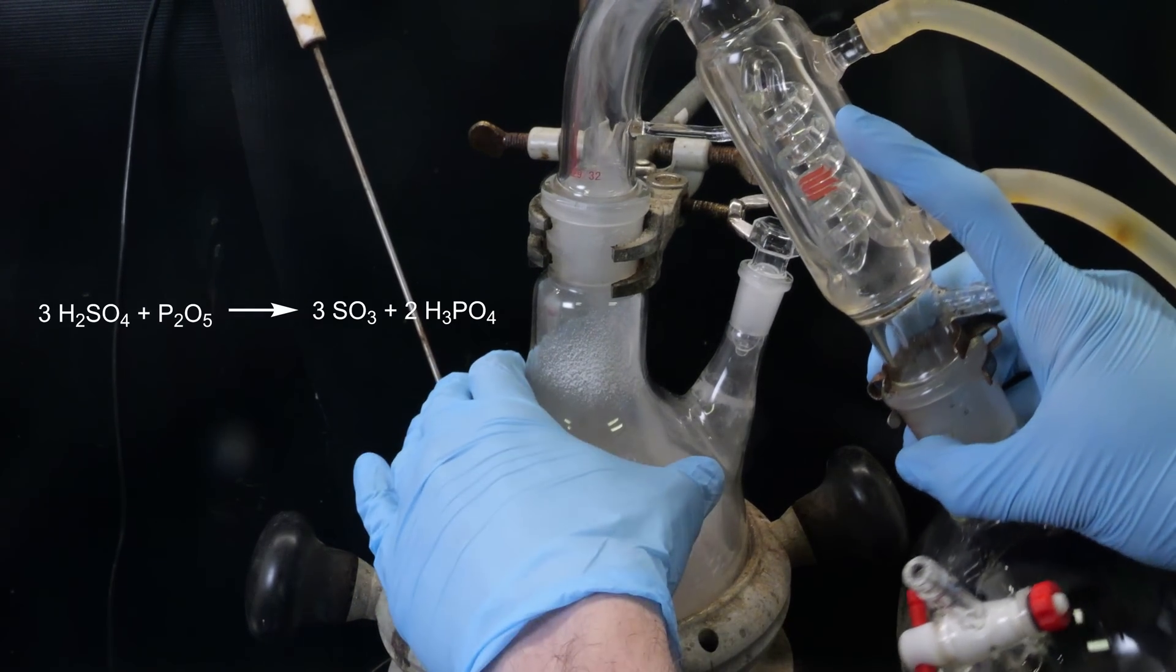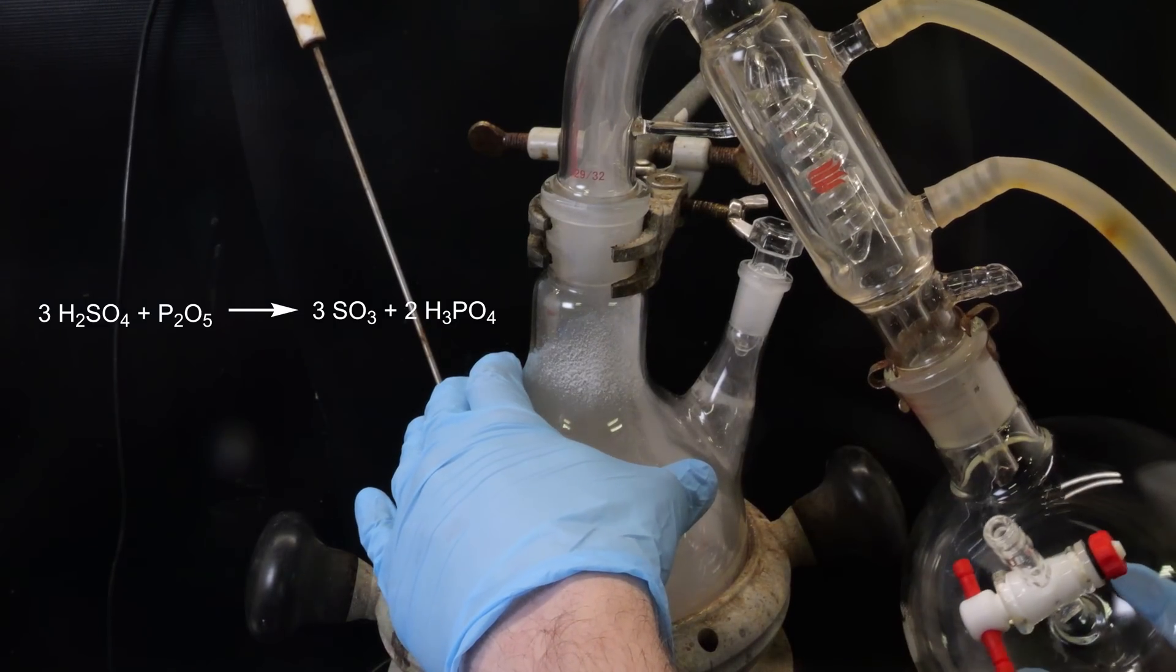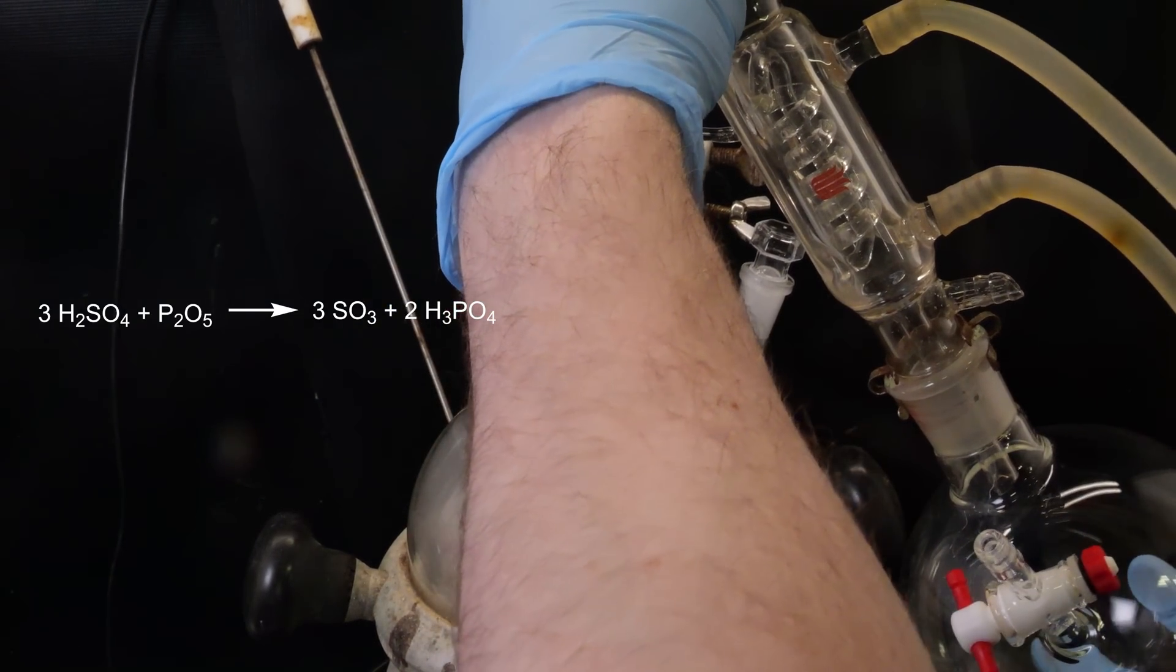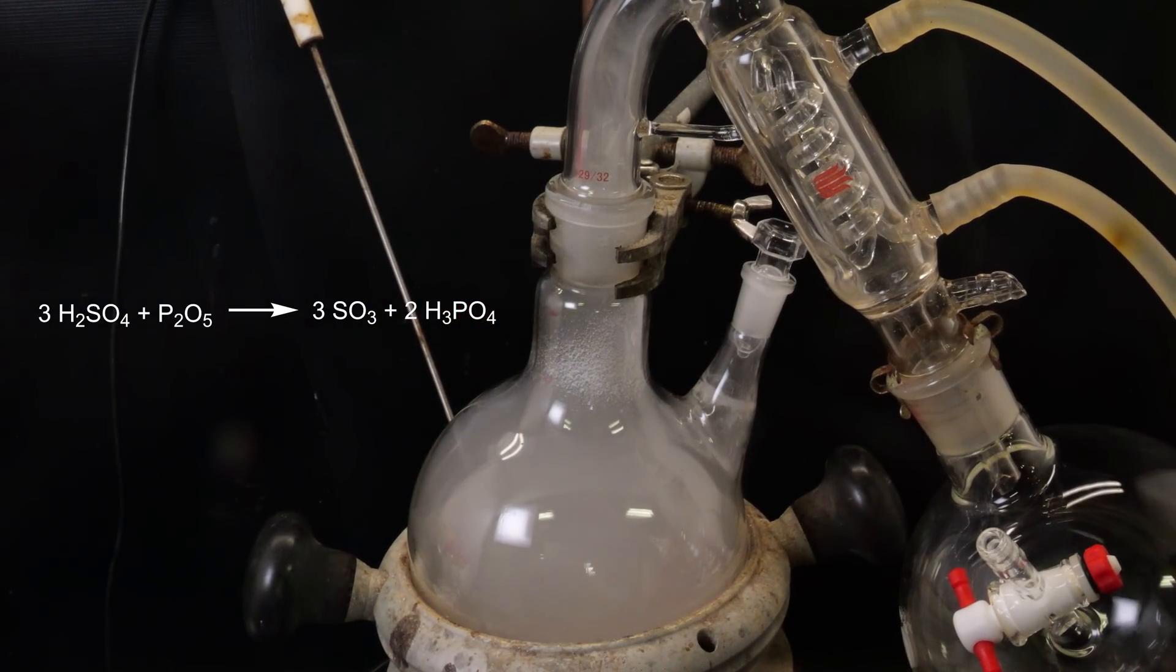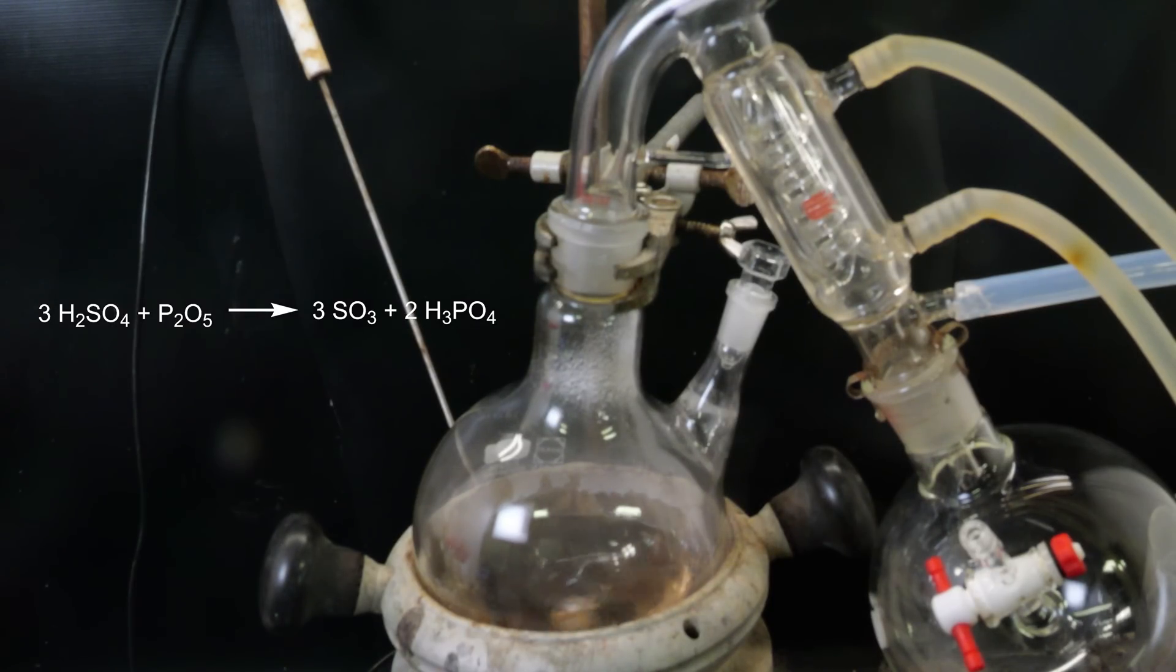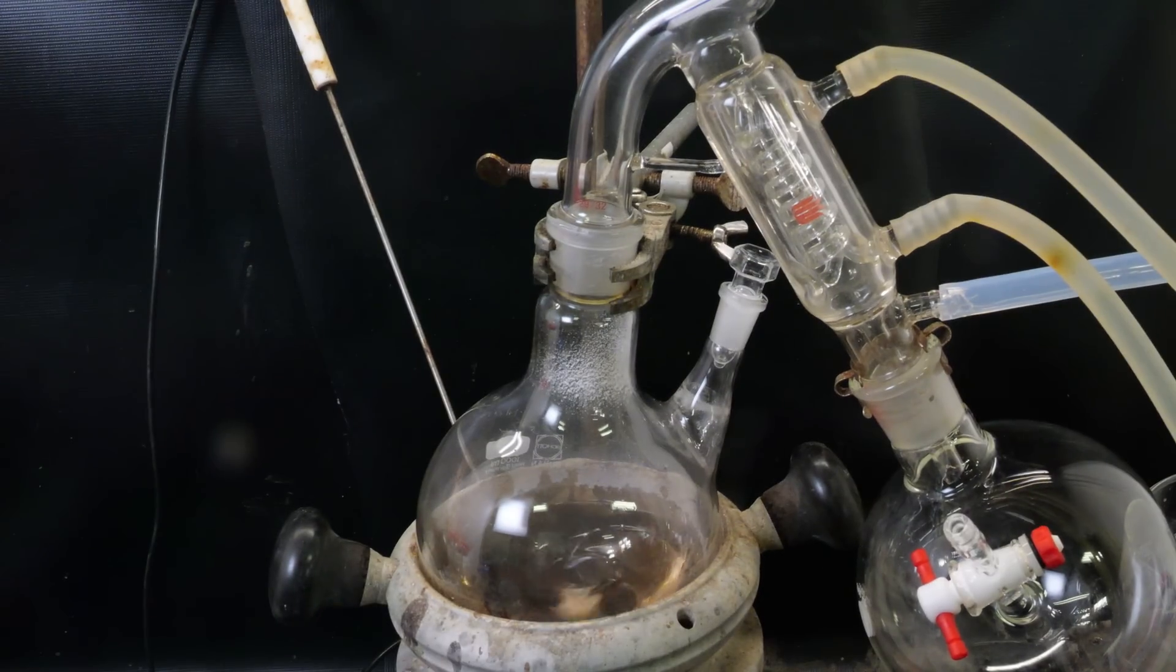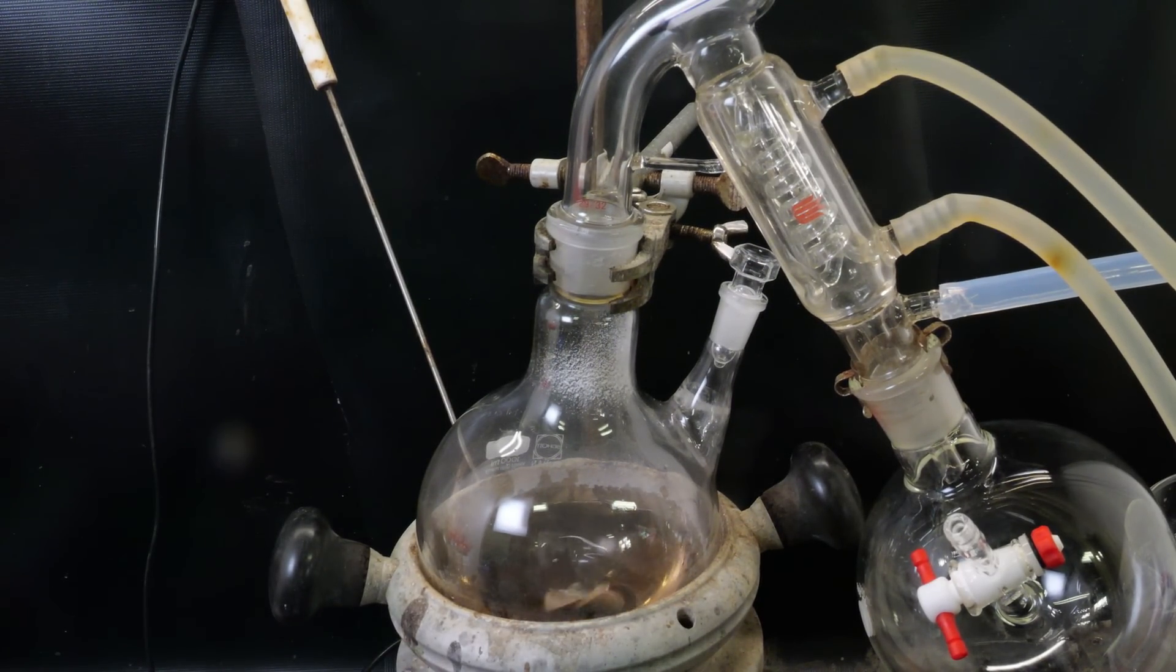I attach a short path distillation apparatus to try to distill over the sulfur trioxide, which has a boiling point of only 45C and a close melting point of 17C. However, since this short path was apparently too short, only when an ice bath was added to the receiving flask would the sulfur trioxide actually deposit from the gas phase.